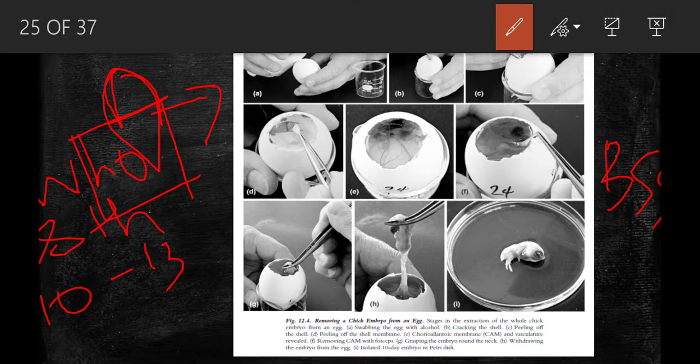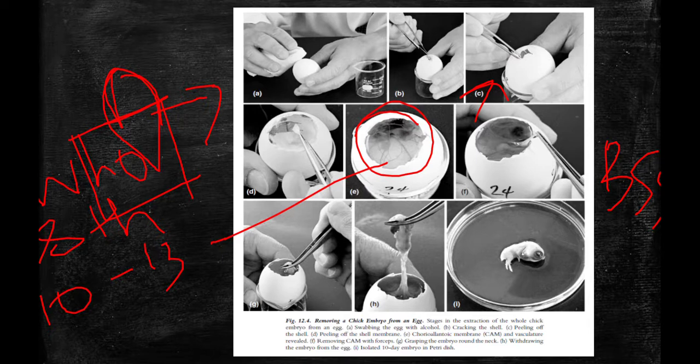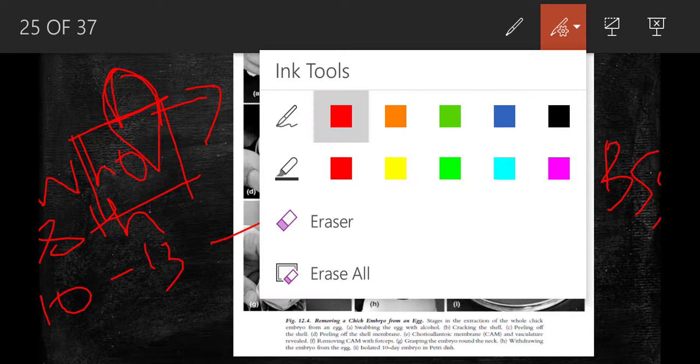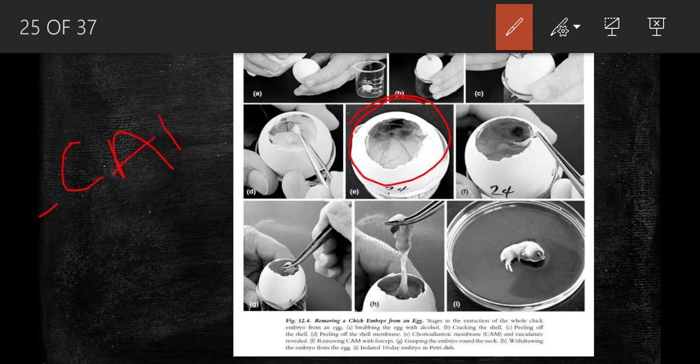Using this forceps, you'll peel out the white shell membrane, and once you peel this out you can see the CAM.